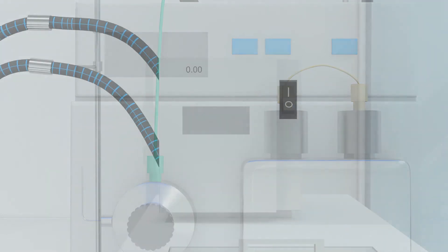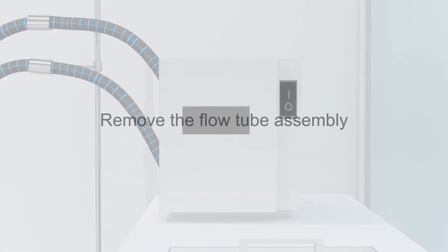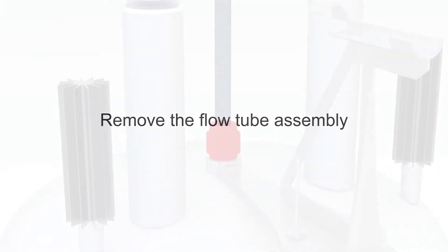Then set the thermostat to ambient temperature. Wait until the temperature is reached and switch the thermostat OFF. This part shows how to remove the flow tube assembly from the magnet.